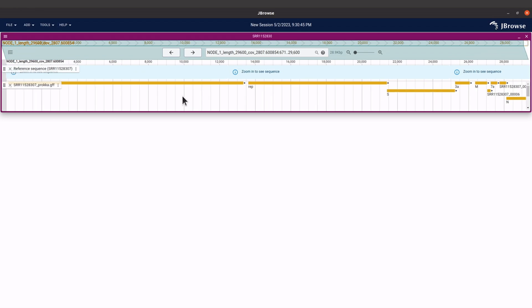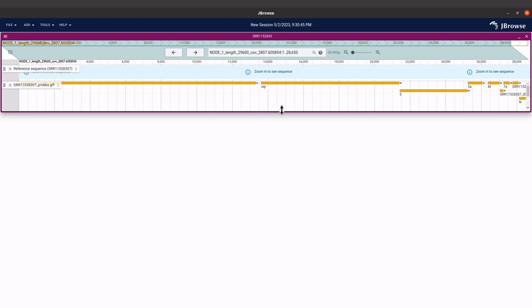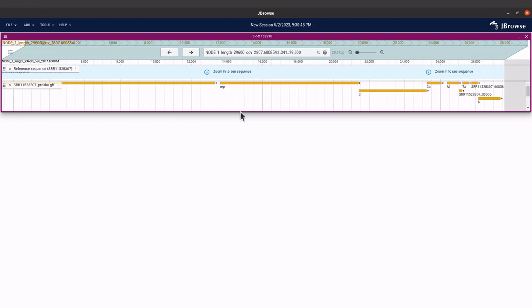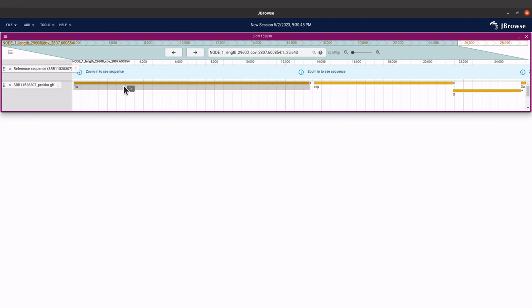What we have here is Node 1 — you can also see it here. Node 1 is this contig. Remember when we checked the number of contigs in the assembly, the scaffolds — we got two sequences. So it's Node 1 that has been annotated, and that's what we see here.